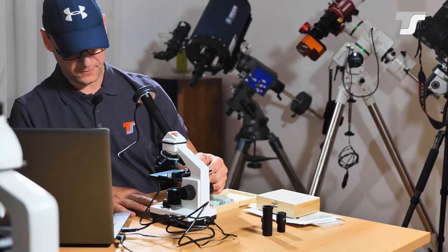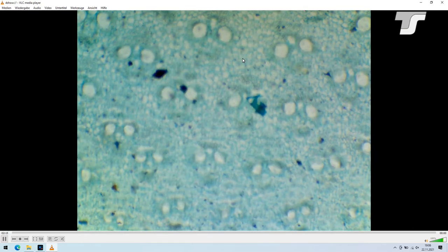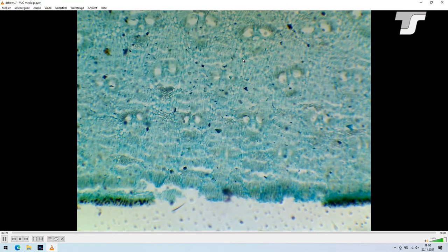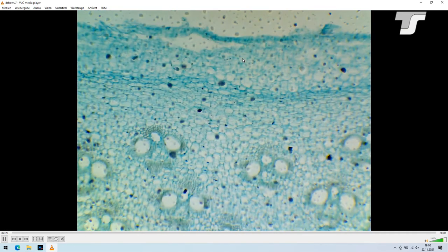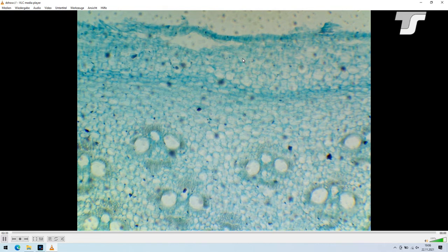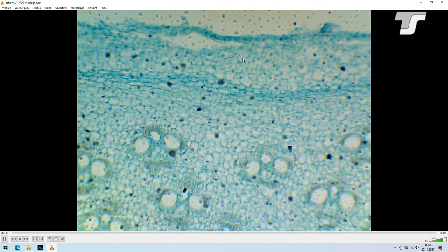Now let's just start randomly. I chose botany and we just let me grab a random sample. That looks interesting. A bamboo stem. And we put the sample on the table. And now we have to find the proper position and the proper focus. Here we are. This was pretty fast. It's a large sample. Here you see the border of it. And let's be in that position. What you can see here with these prepared samples you have some bubbles under the glass and some contamination. This is standard. You will see this also in your own samples. But because the focal plane is so narrow you can distinguish easily between bubbles and subject. It's no problem.